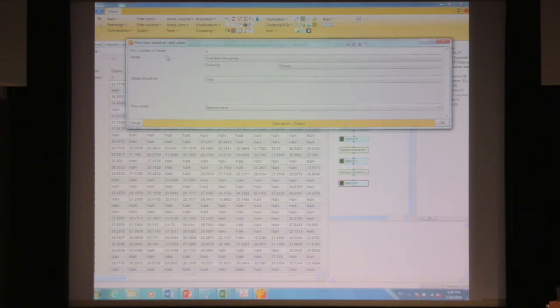And even with matching between runs turned on, we may not be able to identify anything in the control samples or in the other samples, simply because it's many orders of magnitude lower. So if we required 4 valid values in each group, like I've got selected here, then we would potentially throw out a lot of our regulated sites, because now we're requiring them to be in both the control and the stimulated cells.